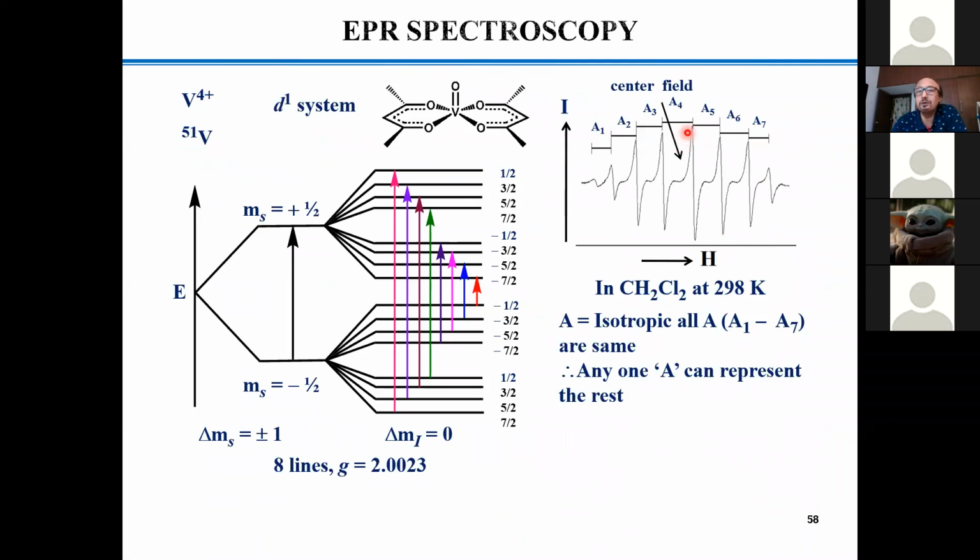You'll see a small peak over here, because you have used a very small concentration deliberately, so that the signal won't be very high and mask the original signal of your unknown compound. From there you can back calculate the H for the radical. G is not known in this case, you only know the H, so you can back calculate, and the G is coming very close to the radical value.